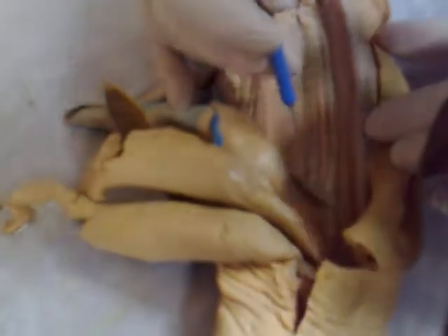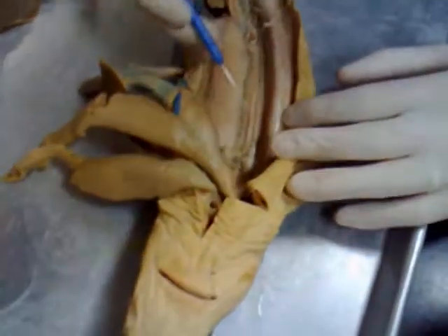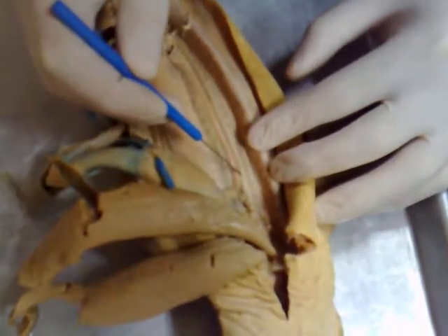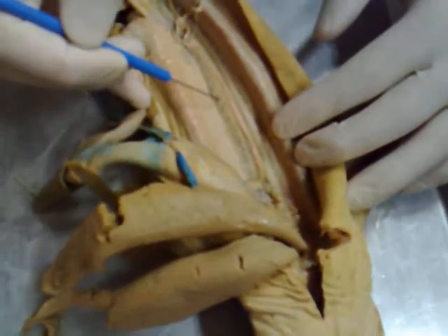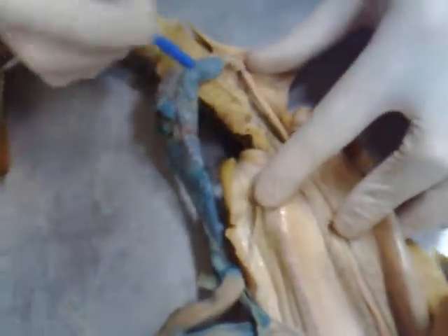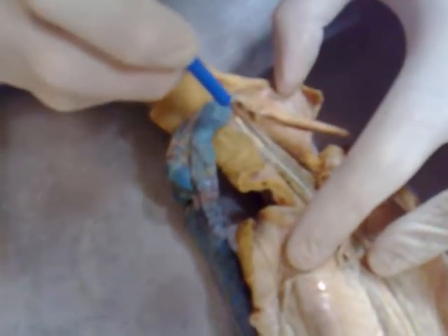So here is the ovary — ovaries are right there. The oviduct is this tube running right down here. Realize the kidney is all underneath here — all this dark stuff you're seeing — this is the kidney.